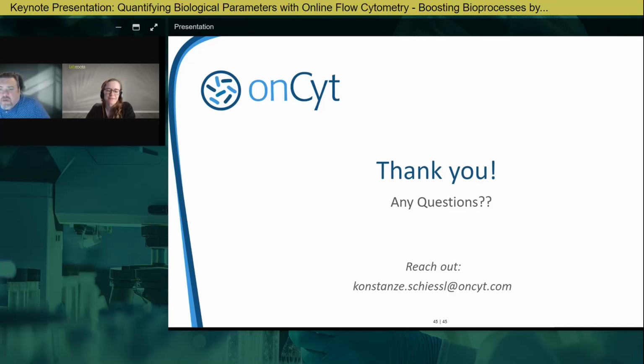All right. Can you monitor any cell characteristics, and what are the limitations? You can monitor anything that you can stain with a fluorescent stain. As long as there's no stain around, you might not be able to. And of course, it's easier when there are already commercially available stains, and there are for many, many things. But I'm sure there are a lot of chemical and biological limitations. Very rare events might make it hard, or very subtle differences might also make it hard. But overall, I think there's a big bucket of things out there that can be looked into.